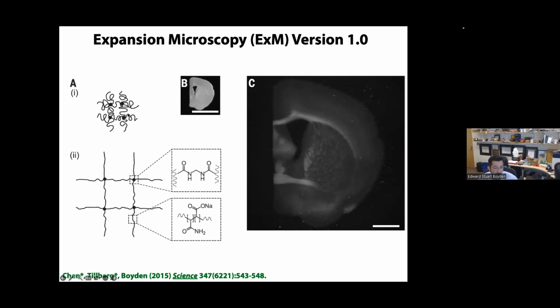The spacing between polymer threads is around 1 to 2 nanometers in size, smaller than many biomolecules. And then after we expand, the baby diaper polymer, the sodium polyacrylate, will attain an extended conformation.